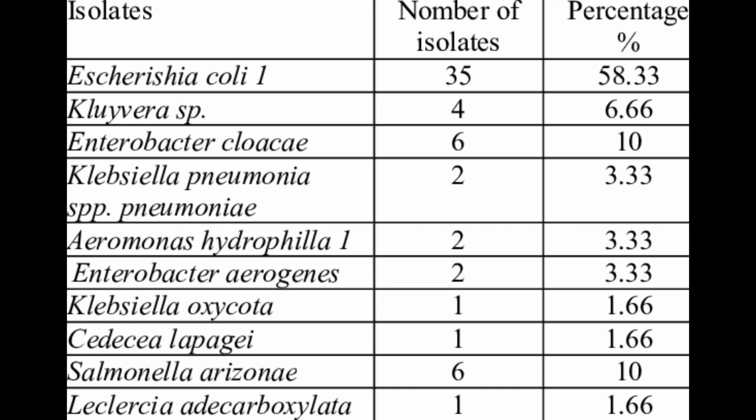In lysine decarboxylation, the negative is bright yellow, because the enteric does not have lysine decarboxylase. Now let's talk about lysine deamination. The positive is red.